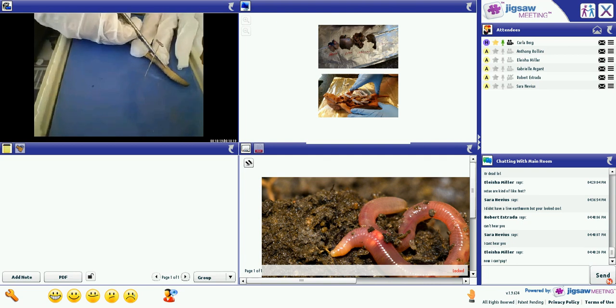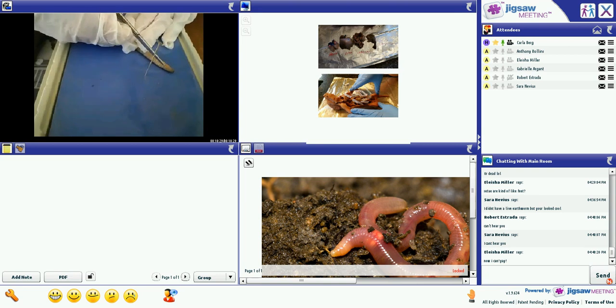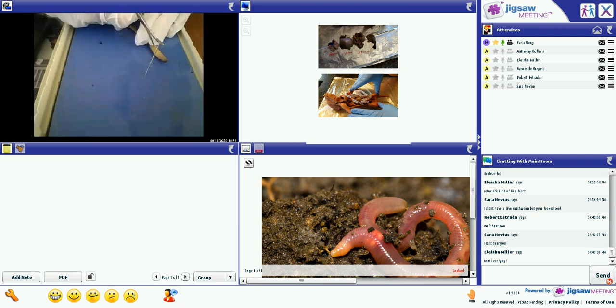You can reposition your worm as often as you need to. There's nothing wrong with repositioning it. You're going to have to clean your whole tray anyways, so it doesn't matter. Once you're at the tip, you're going to stop. So right now, all you have is just a strip down the center. But in order to see inside of our worm, we need to open it up.